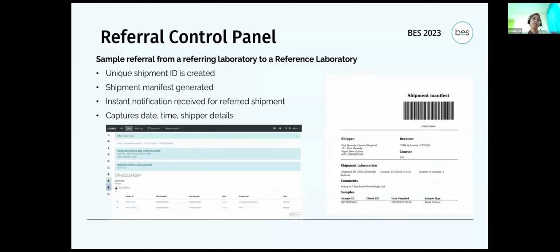Thank you. Sample referral from our referring laboratory to our reference laboratory. Here, a unique shipment ID is created, and all the samples that are supposed to be sent away from the lab are listed under this shipment. The shipment manifest is generated once the shipment is ready for delivery.